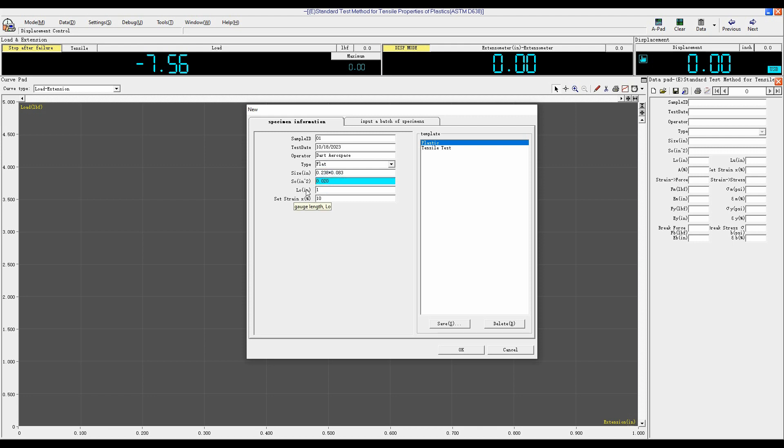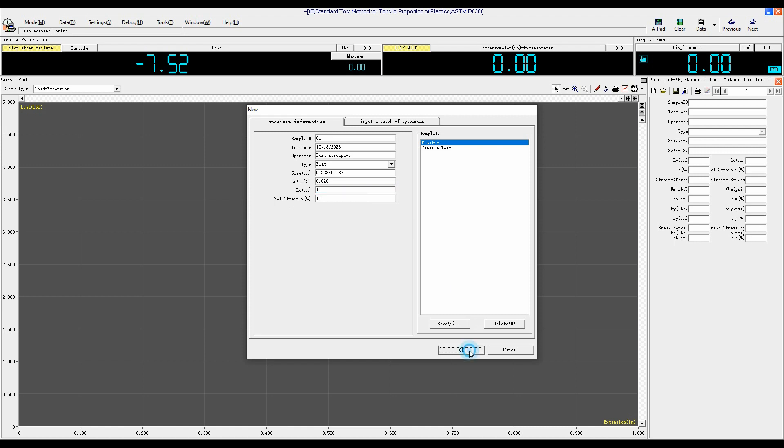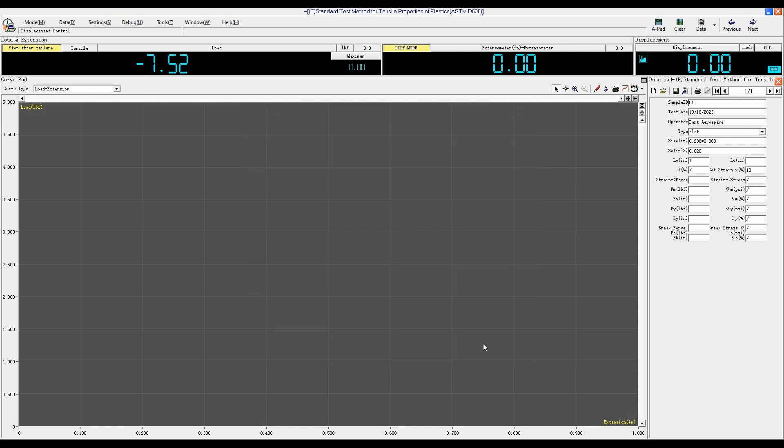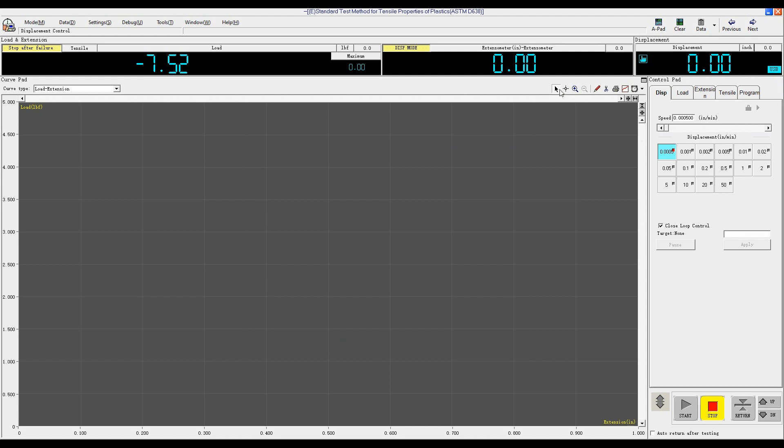LO means the gauge length. And the set strain, like 10% and click OK. Close Date Pad.